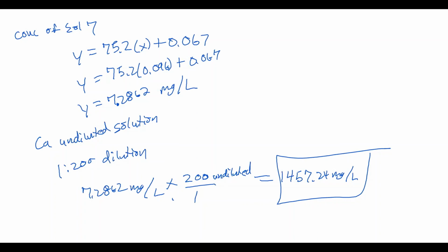Now, you want to go and finish the other 3 questions. So you want to tell me what the atomic absorption process is used for, right? And so one thing that I would recommend for question number 2 is that if you don't have an equation in there, it means that you're probably missing something. So look for your equation that ties in absorbance and concentration. And this should be from your theory, not just your trend line equation, but go back to your theory.